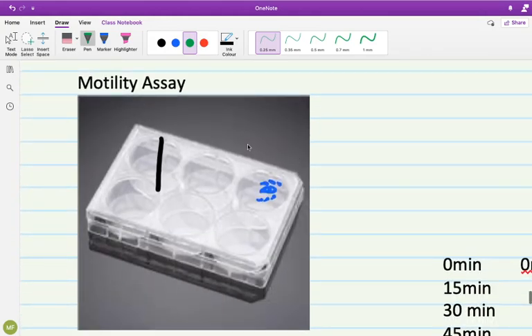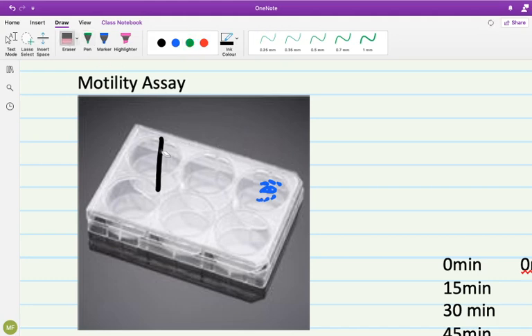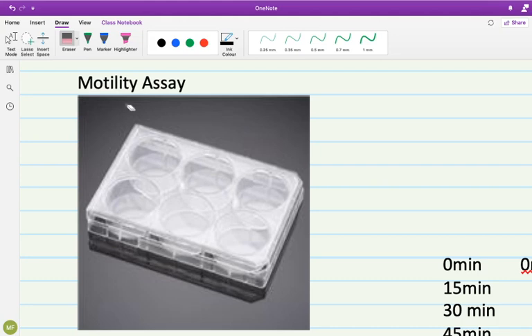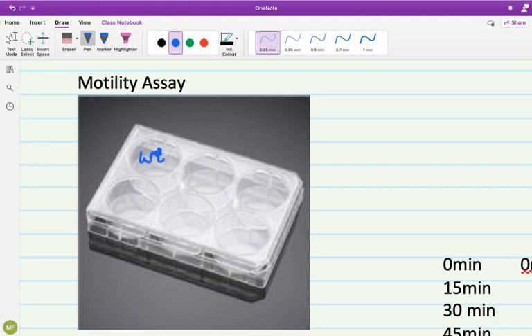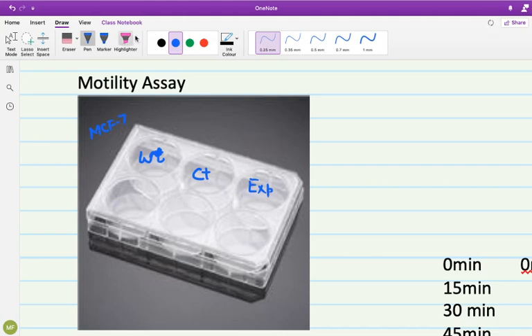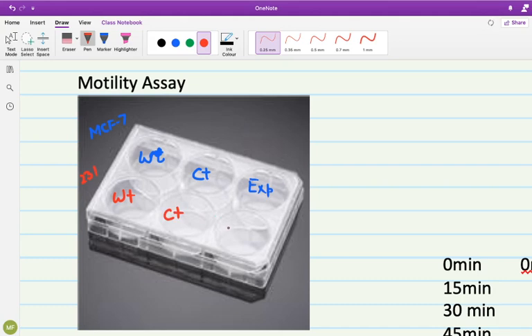Next assay is about the motility one. If we are talking about the motility assay, we are using six wells plate. The difference or mentioning of this six-well plate is because we want wider wells to see under the microscope. This is control and this is expression for the gene of interest. Let's say we are talking about MCF seven cells in motility. We are talking about wild type, control of MDA231, and the knockout of RAS. This is all the setup we are going to use.